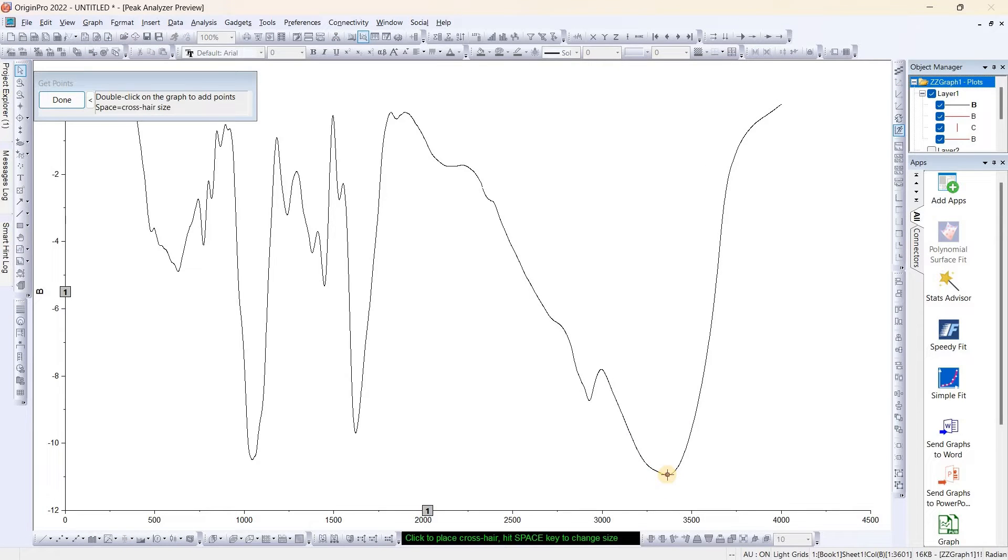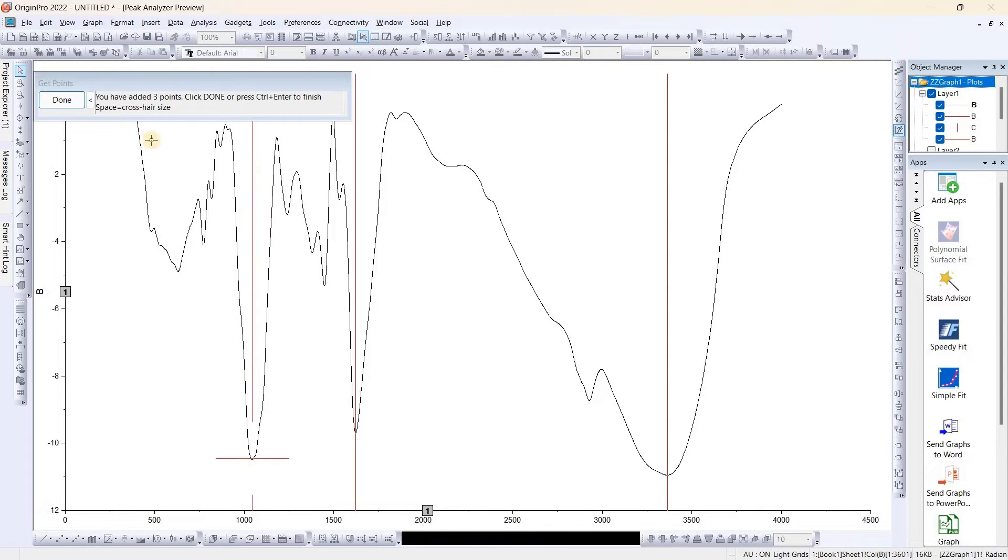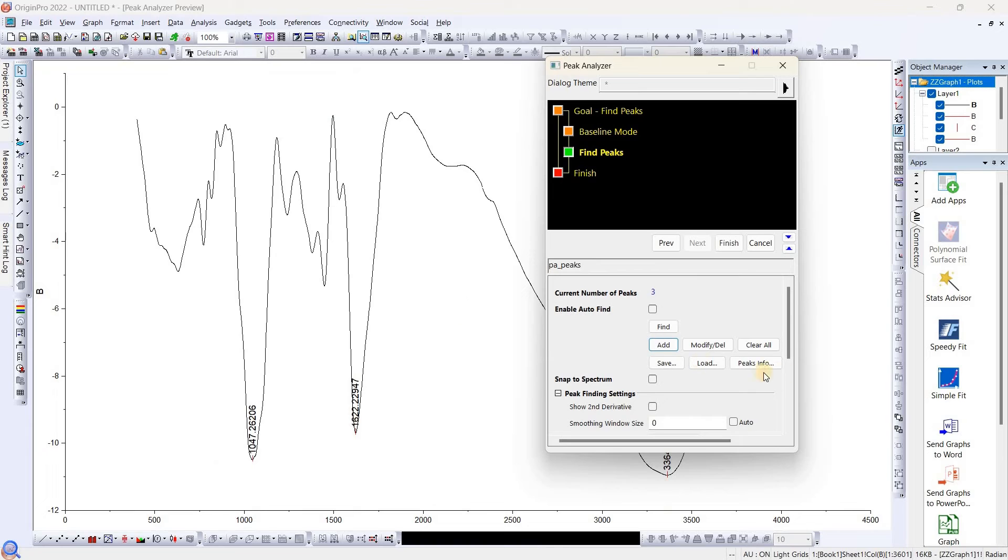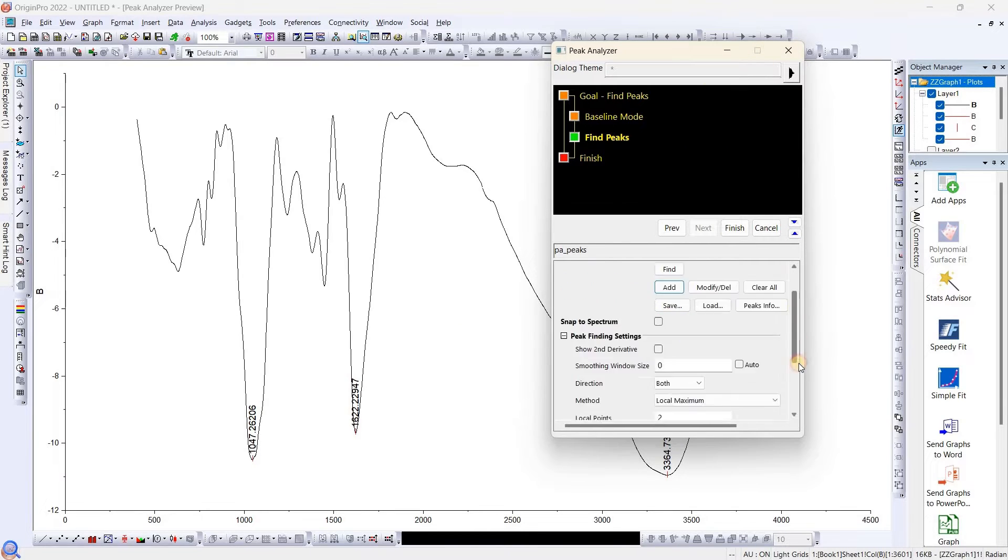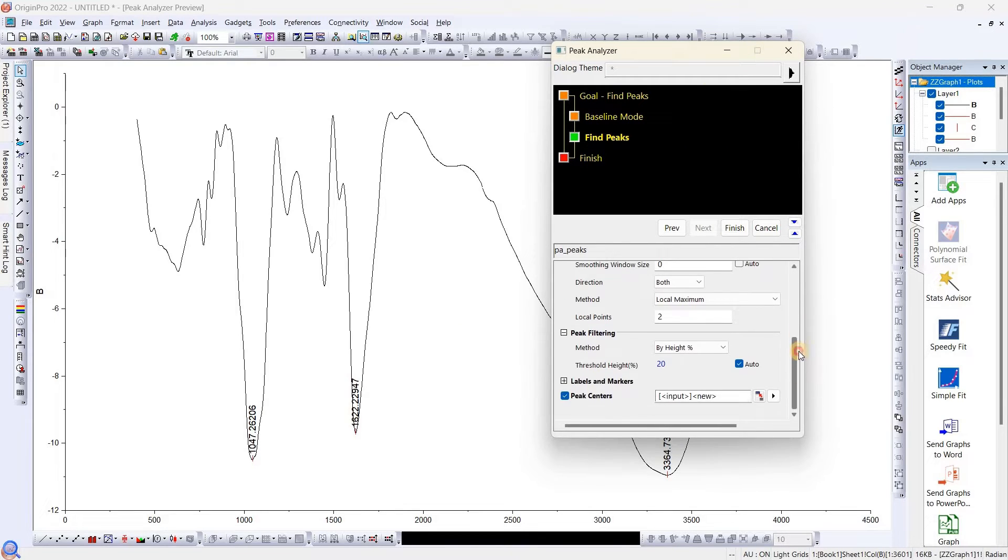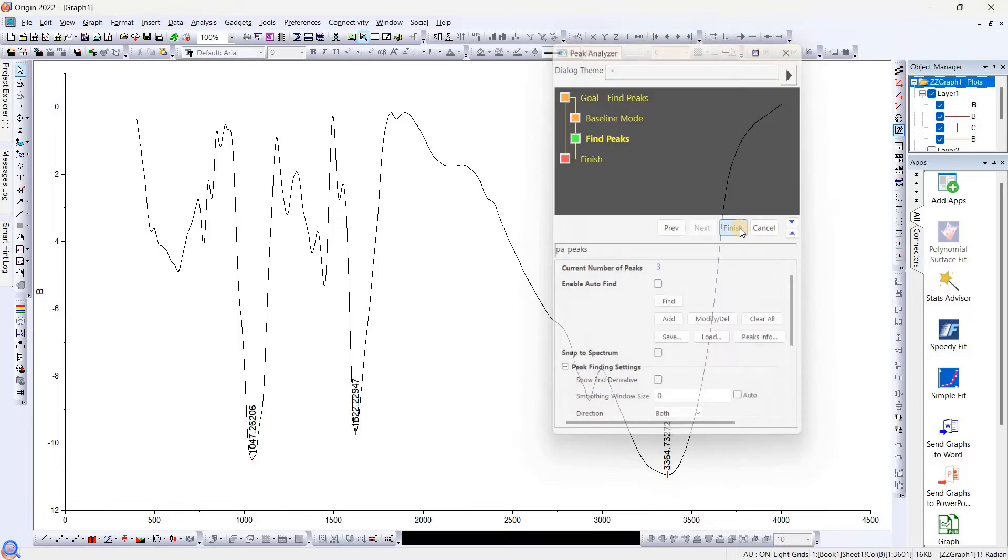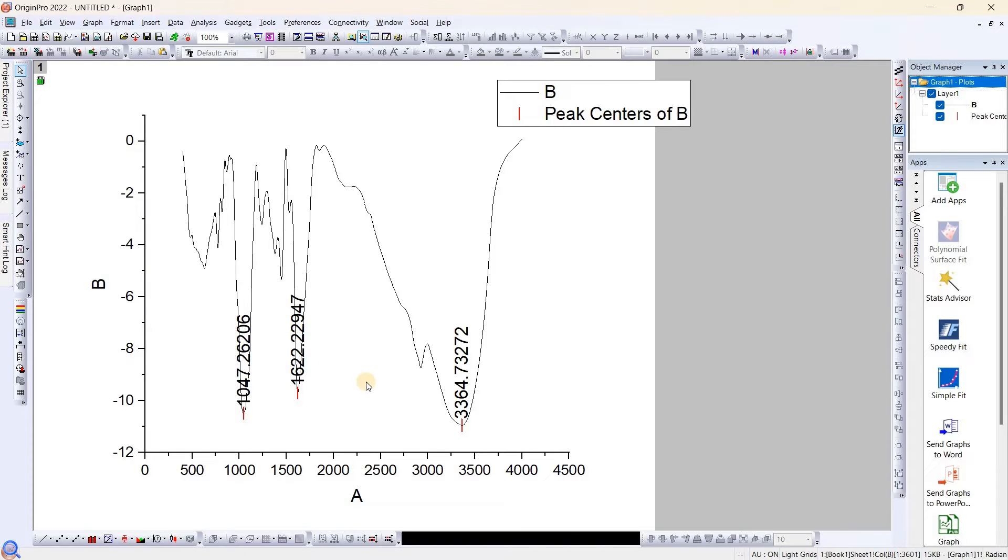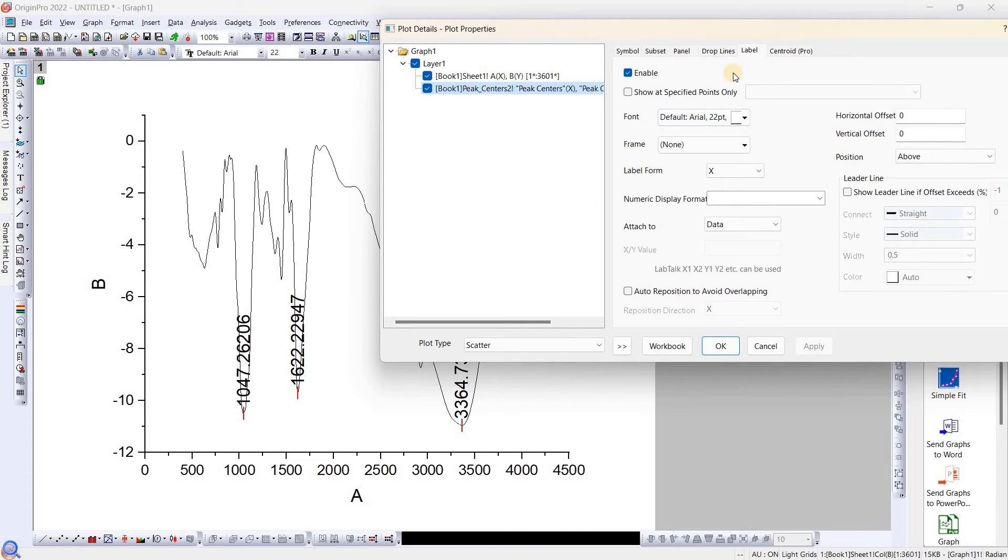Then we need to add the peaks. For quick presentation, I'm just selecting only these three peaks. We can select many more as per your requirement. Once we did this, we just finish it. As we can see, this has plotted.